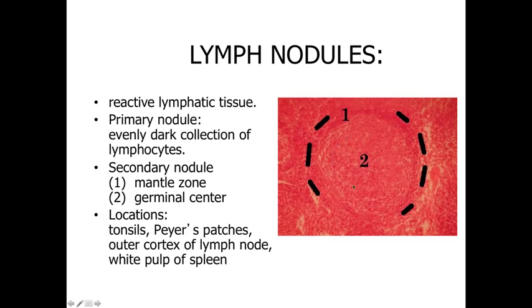To the inside of that mantle zone, we're going to have a lighter staining appearance — still lots of basophilic staining because we can see the nuclei of all these B lymphocytes — but lighter than the densely packed lymphocytes in the mantle, because these cells have become activated. They're larger cells with more cytoplasm, involved with producing antibodies because they've been activated in response to a potential pathogen. Lymph nodules are found in the Peyer's patches of the intestines, in the tonsils, as well as within larger organs like the lymph node and the white pulp of the spleen.